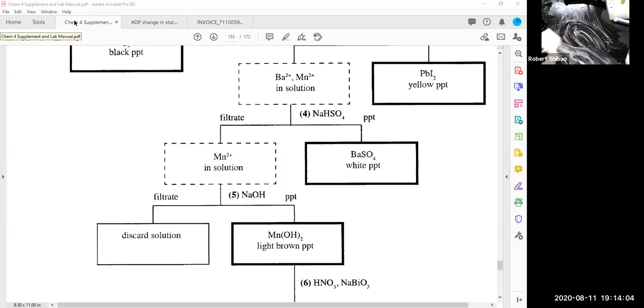So what happens is people are repeatedly poking, trying to get that lead to dissolve, right? And so they're poking at the bottom. Here's a chunk of the test tube. You've got to watch out because as far as accidents go and as far as safety goes in the laboratory, burns are number one, and then cuts are number two. Broken glass, sharp edges. And then spills are number three. They spill stuff on their hands and arms.